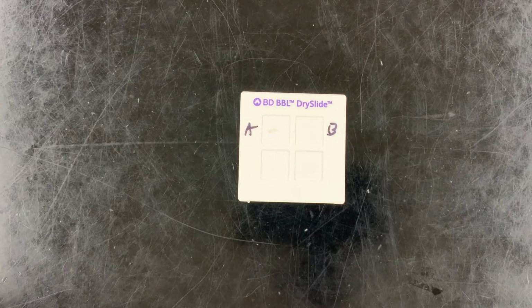And then while I'm waiting for this to cool, I'll just remind us of this idea of the presumptive test, right? Remember, the presumptive test means I've already done a little bit of work. I have these two bacteria. I know that they are gram-negative rods, and when I hear gram-negative rods, I think, oh, it's got to be enteric or non-enteric. So I'm going to do an oxidase test to help me determine the identity of these things, right?